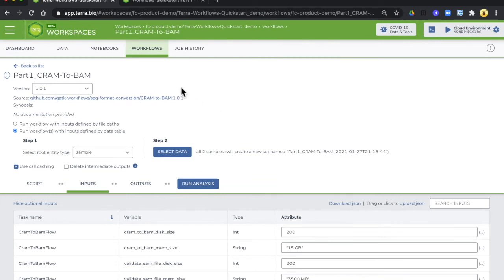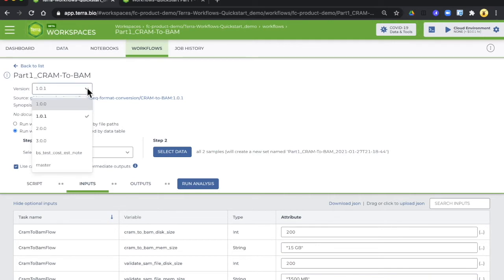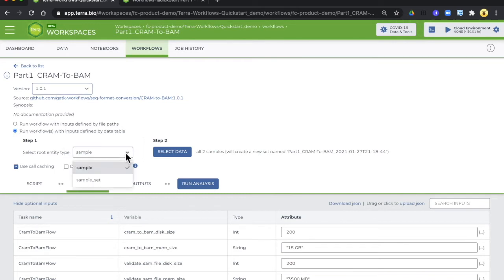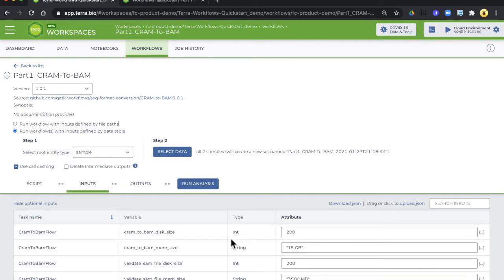So some things are already set up. The version is fine. We want to run the workflow with inputs defined by the data table so the correct radio button is selected. We're going to run on data that's in the sample table so that is correct and all the inputs and outputs and things from the bottom of the form have already been filled out.